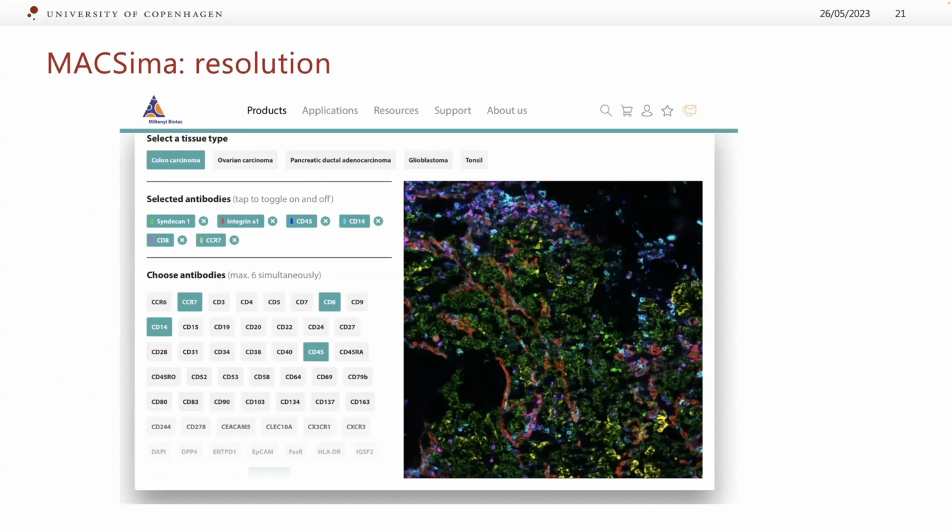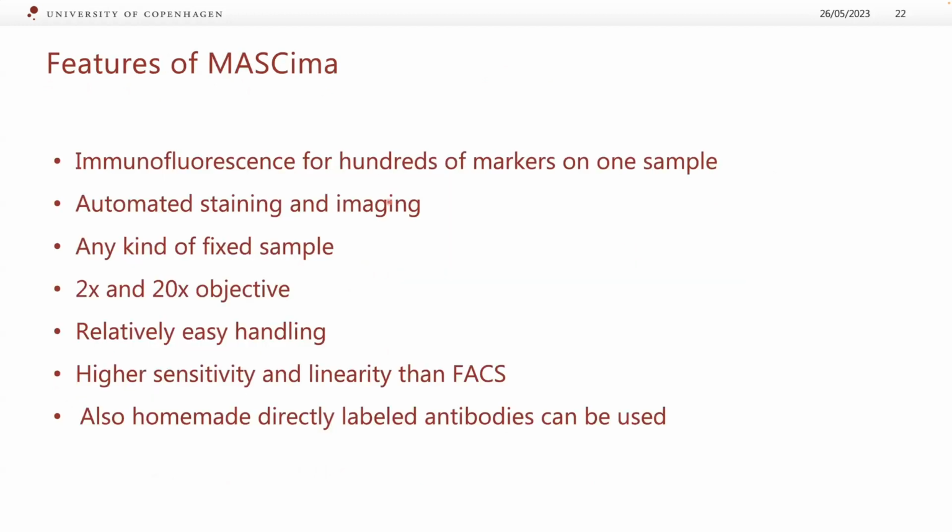And here, for example, there are multiple proteins here. I don't remember how many overall, but you see there are many here, and you can select some of them, and then you can see where they are distributed by color here. Here there are some features.